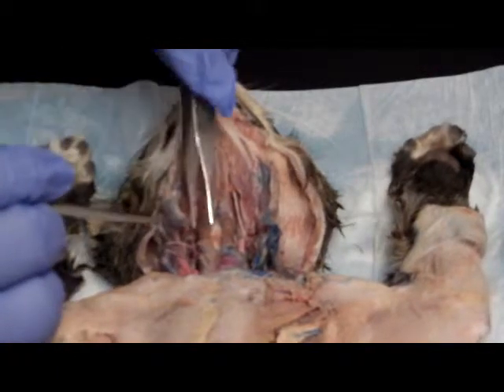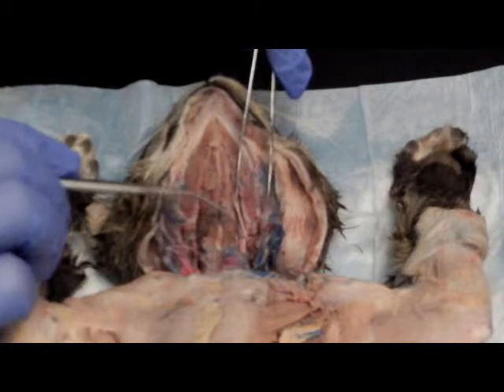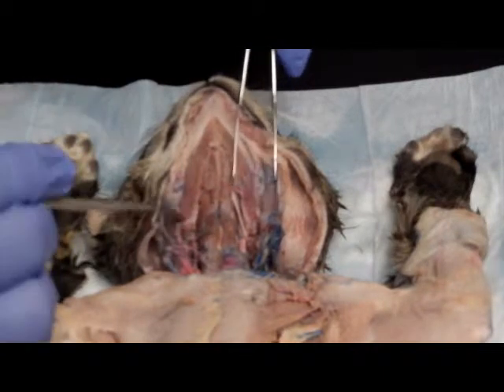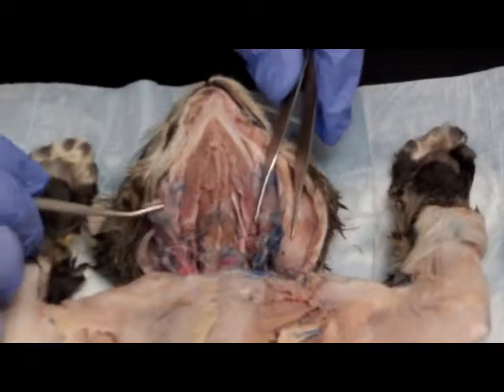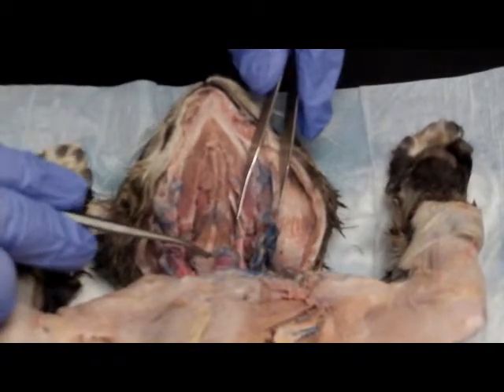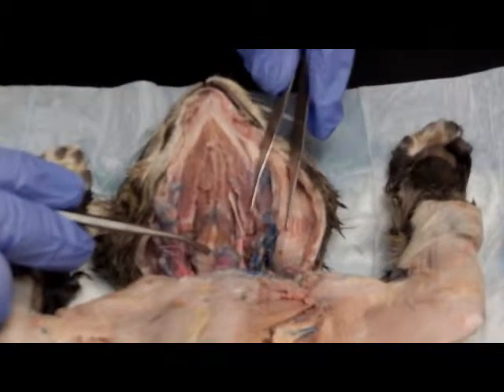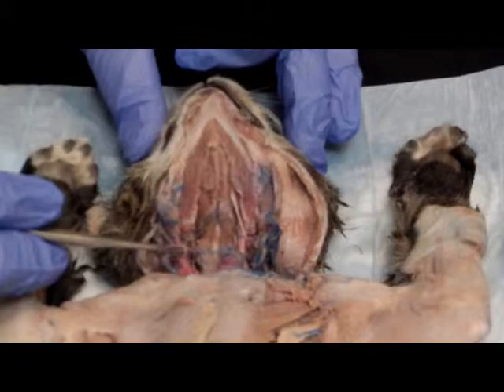The sternohyoid, both these right here. The origin is the manubrium and the medial end of the clavicle. The insertion is the lower margin of the hyoid bone, and it depresses the larynx and hyoid bone if mandible is fixed, may also flex skull.